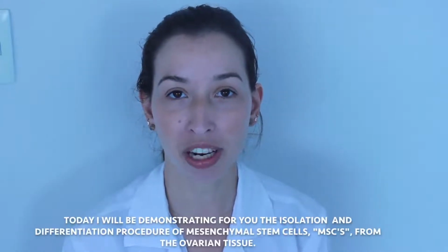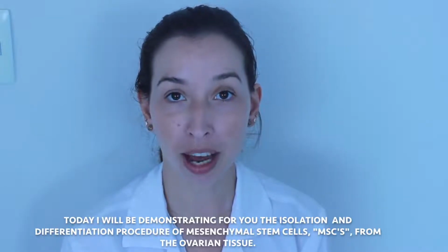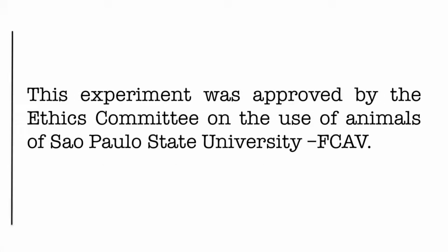Today, I will be demonstrating for you the isolation and differentiation procedure of mesenchymal stem cells, MSCs, from the ovarian tissue. This experiment was performed with the ovaries of 4 mongrel female dogs donated after elective surgery at a canine sterilization program. This experiment was approved by the Ethics Committee on the Use of Animals of São Paulo State University, FCAV.